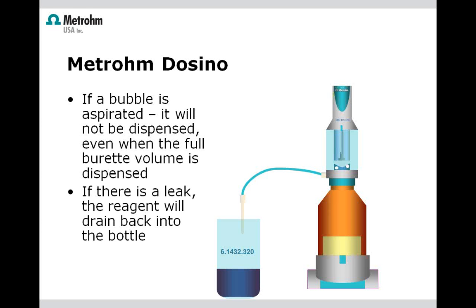Additionally, if there is a leak, which does not happen very commonly with these systems, the reagent's going to drain straight back into the bottle, which is one of the reasons for this orientation.